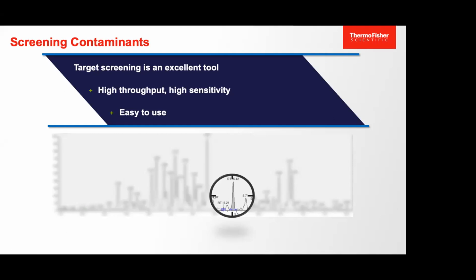In this room, we have about 20 plus people. If a mass spec works something like this, a person passes through this door and they are doing a screening. This is what the mass spec is doing. Just assume that we are the compounds inside the sample. It can be at very low concentration, parts per billion, ppb, or parts per million.